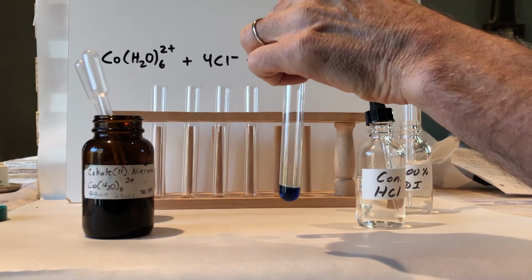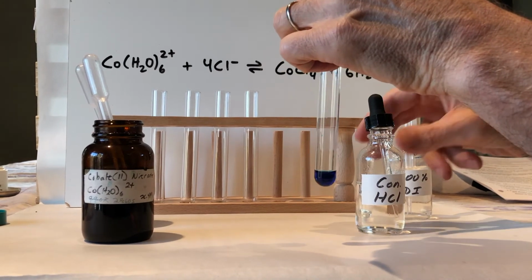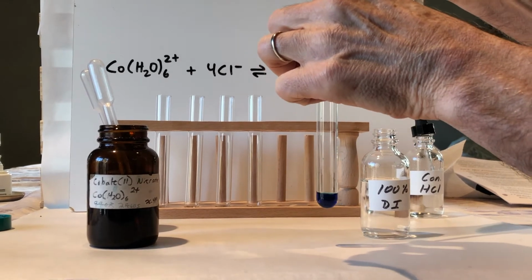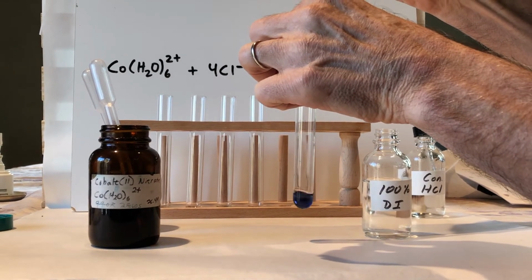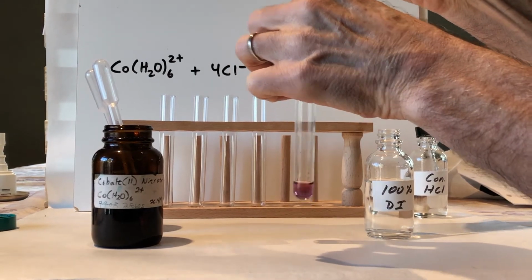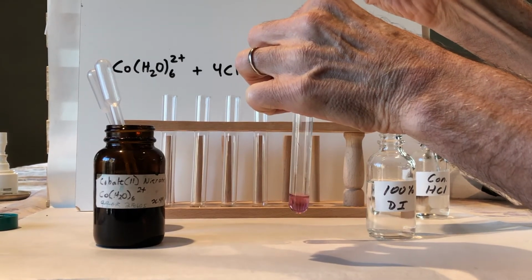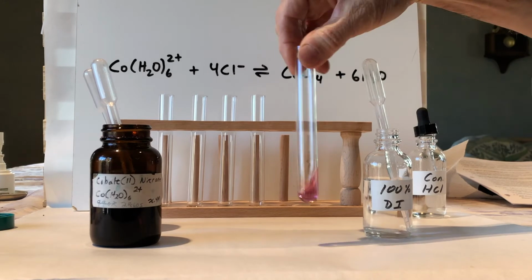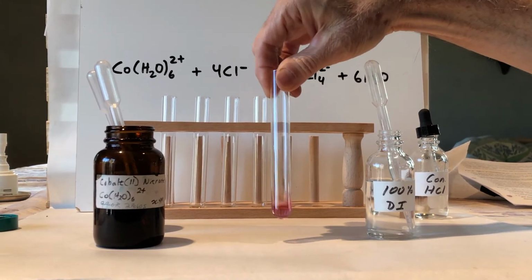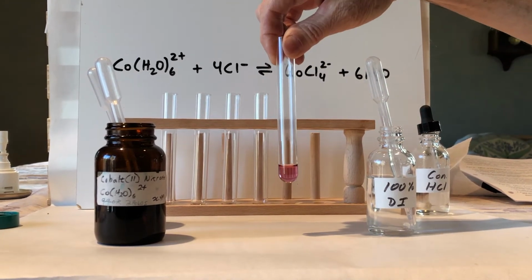And then after doing that, we're going to add some distilled water. So distilled water, 1, 2, 3, 4, 5, 6, 7, 8, 9. And that's what happens when you add 10 drops to the system. So we've had a stress on the system twice now. We added Cl-, then we added H2O. So explain what's going on with that.